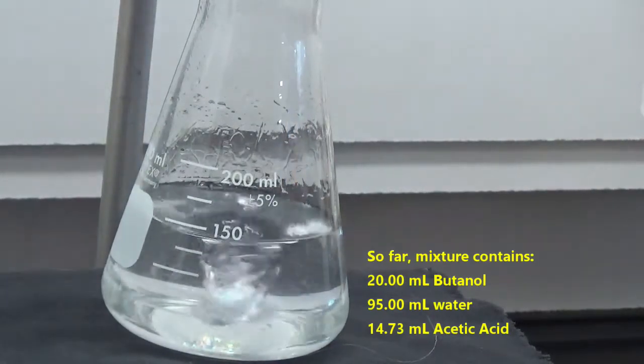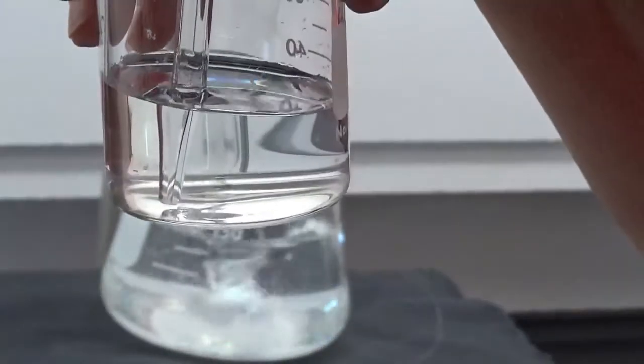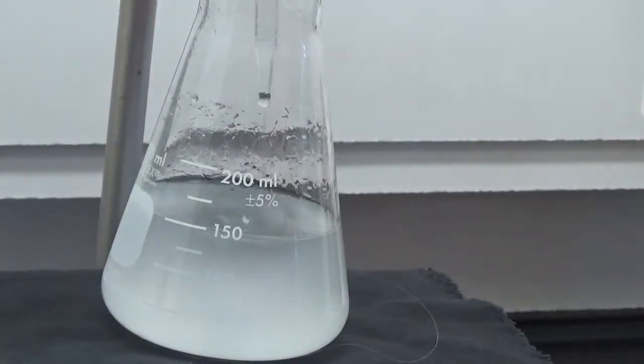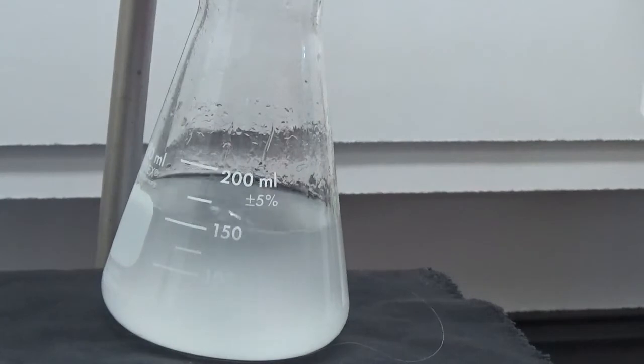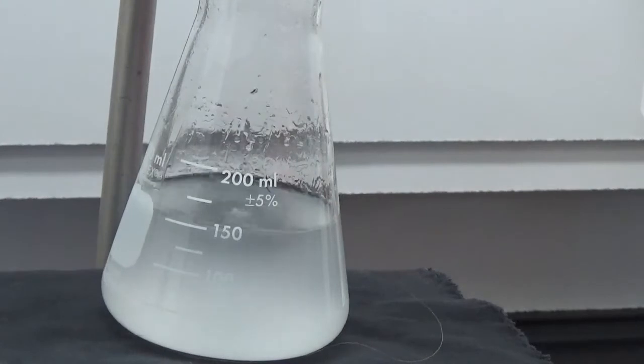And now the last one. It's clouding up. Adding the acetic acid.